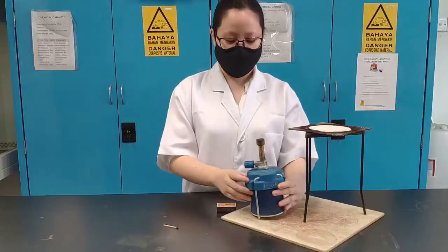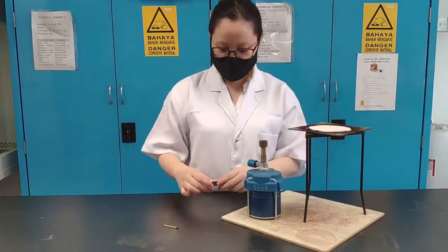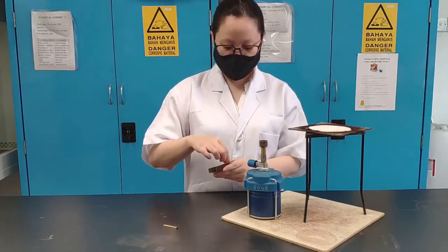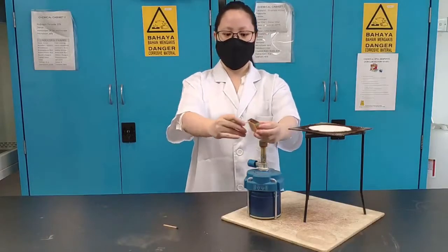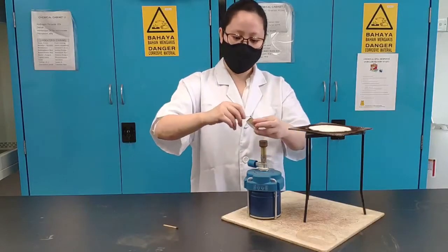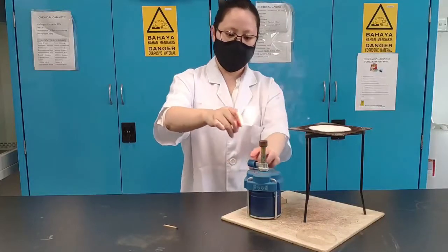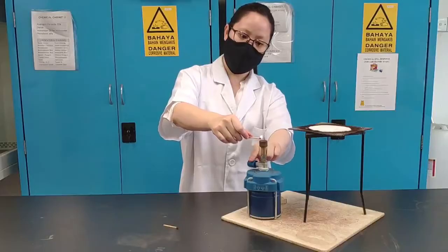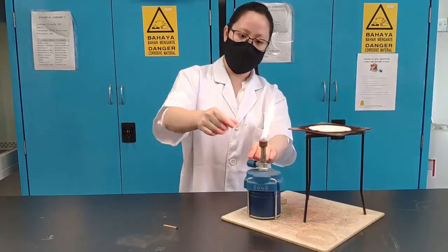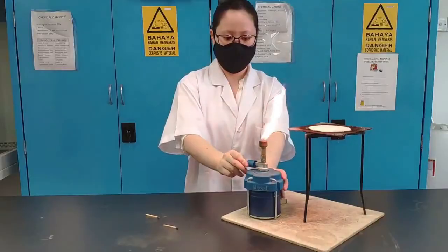The first thing we're going to do is make sure it's tight and the gas is switched off. Then you can take a match and light it. Make sure you step away from the Bunsen burner so you don't burn your face.